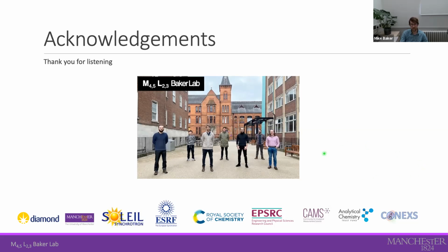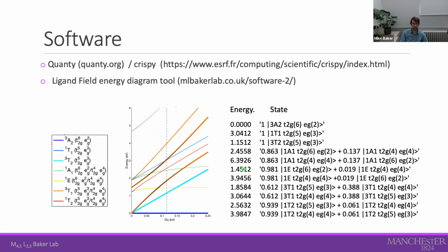In particular, Miran Huzan. Miran and I have been working recently on the use of Tanabe Sugano diagrams for interpretation, mainly actually of 2p 3D RIXS, but they also serve well, as in the talk today, for interpreting K pre-edges. And we're putting together a tool that enables us to do this type of analysis I talked about today.